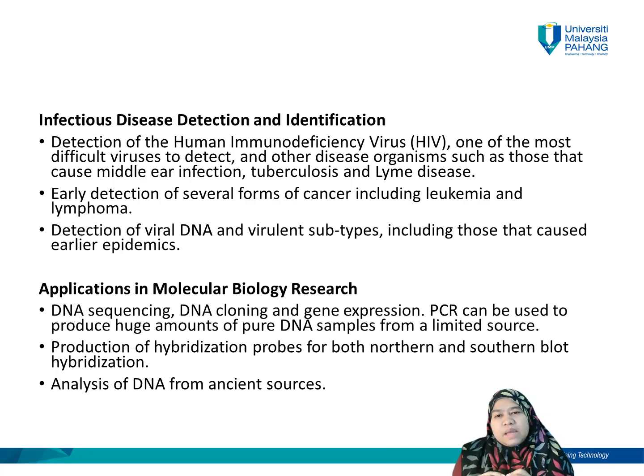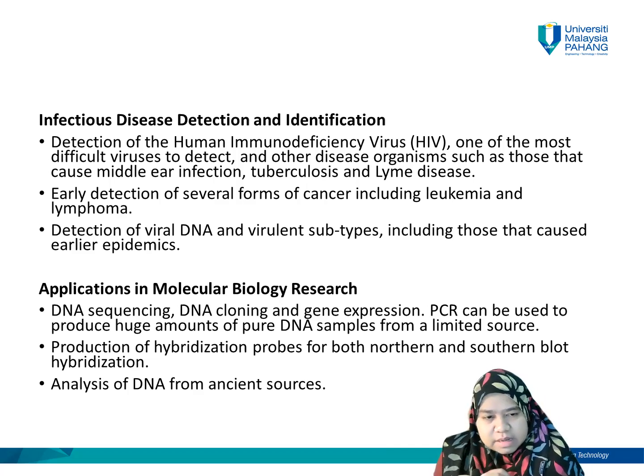Detection of viral DNA and virulent subtypes, including those that cause the earlier epidemics. Okay, this happens in COVID-19 as well. So you can see how much the viral load is in the patient through the real-time PCR, as well as antigen detection.